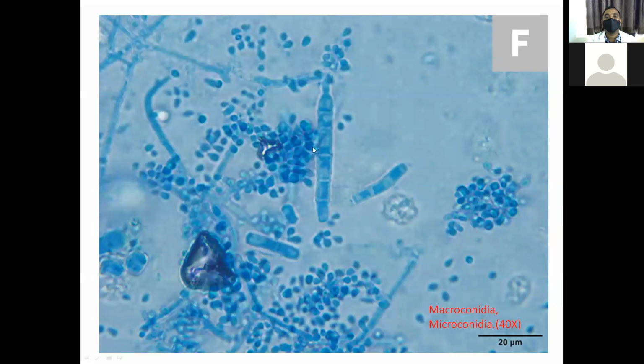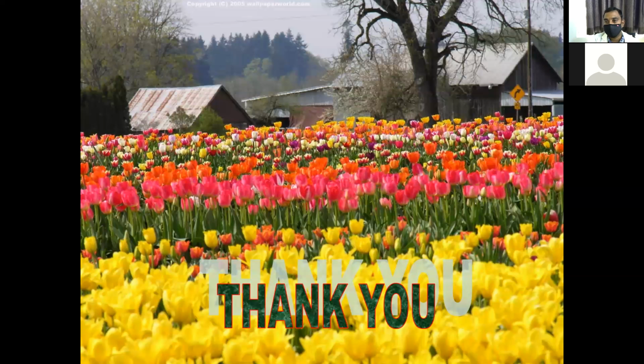Rhizoids. And this one is dermatophytes like Trichophyton mentagrophytes. You are very clearly observing Trichophyton mentagrophytes macroconidia, and these all are microconidia. This one is macroconidia. With this, you have finished the slide culture technique. Okay, thank you.